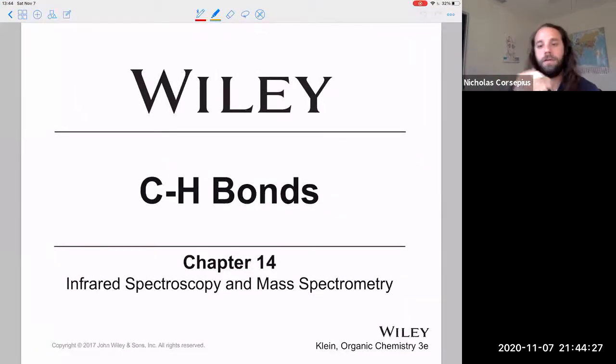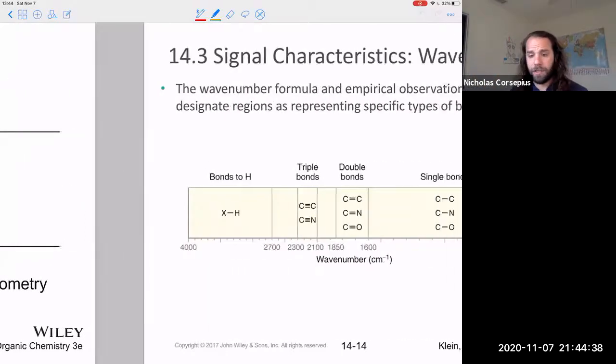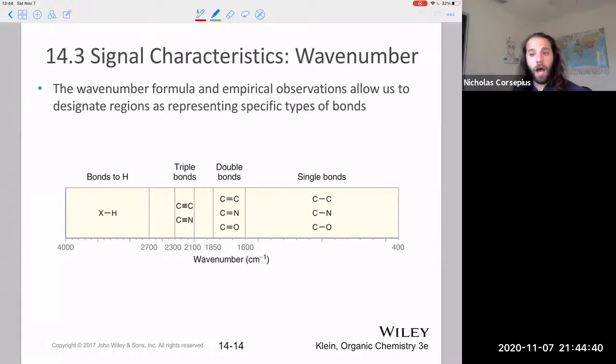All right, so now let's go into the particular functional groups that I want you to be able to identify, okay? First and foremost, the CH bond. So this is obviously going to be one of the most common that you're going to see in just about every IR spectra you take, because just flip back in your notebook, right? How many compounds that we've seen have carbon and hydrogen bonds, right? That's kind of the name of the game in organic chemistry.